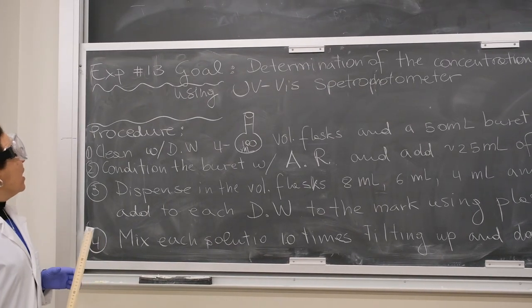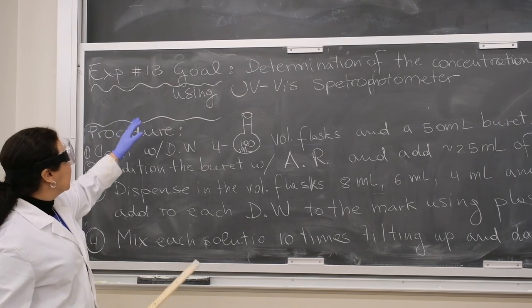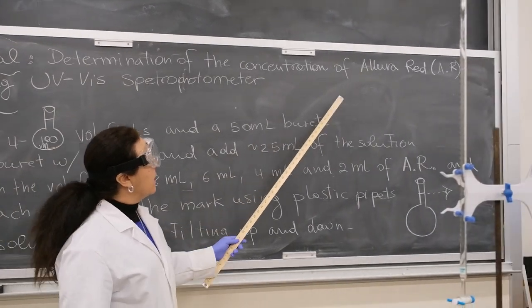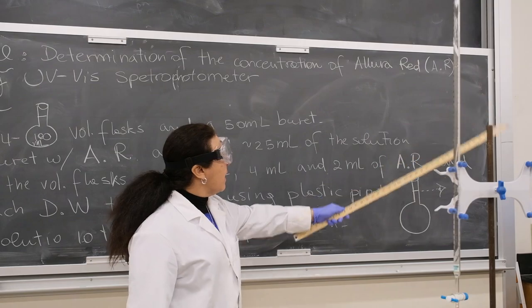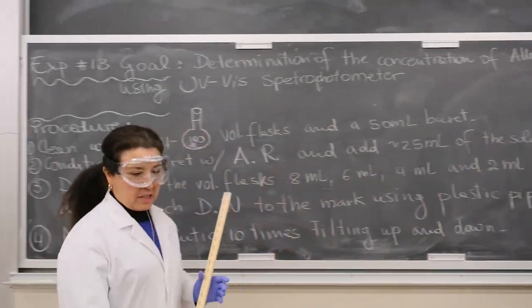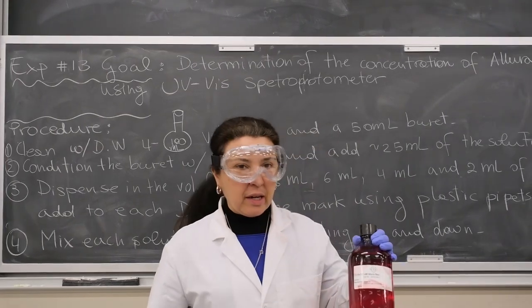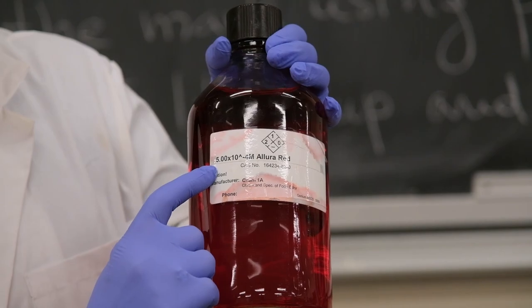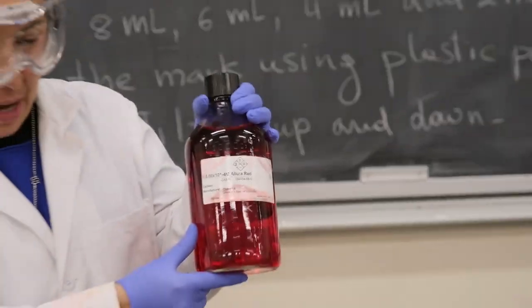Yes, okay. All right, so today we are going to work on experiment 13. We are determining the concentration of a dye, a food dye, Allura Red. We're going to call it AR, using spectrophotometry. The Allura Red is this solution here. You find that in your hood. The concentration is written here for the Allura Red, but it's also reported in your lab manual.